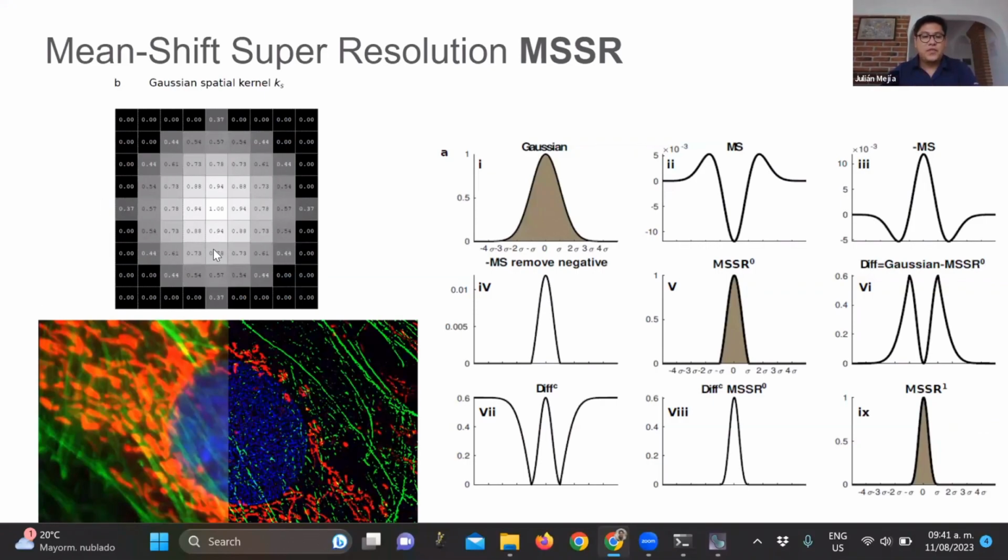It is two things. First, you use a Gaussian mask to do a Gaussian weighted average of the information that you have in there in the spatial sense of the image. And then, remembering the intensity, here we are depicting the intensity as a Gaussian distribution, you apply something called kernels, or the shadow kernels.